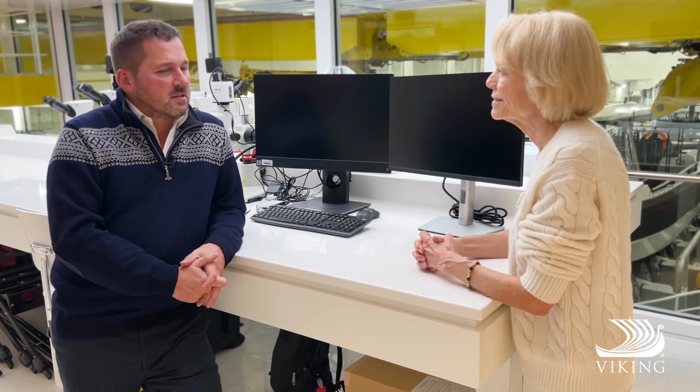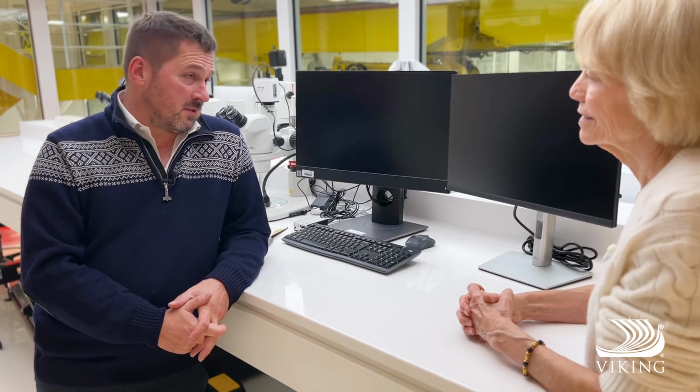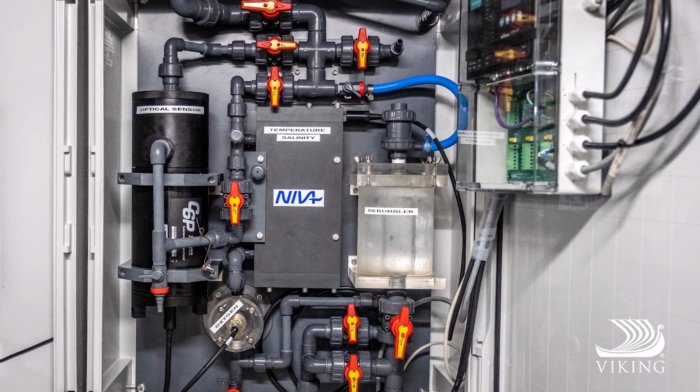It's magnificent research. It's those moments that I think any given voyage, you never know what the guest might see. But the principle is that if you look enough, you'll always see remarkable things. And in contrast, I'll give you a contrasting point, is that we measure microplastics every single day. We manually sample about 10 tons of water, about 10,000 litres every day. Every day. And that's filtered through a system called the Ferry Box, which is an automated oceanographic sampling system on board.